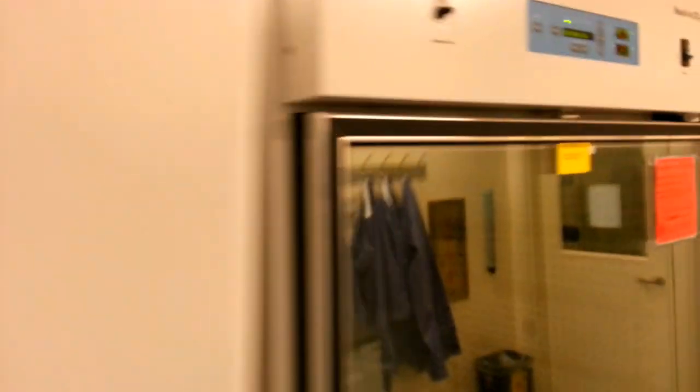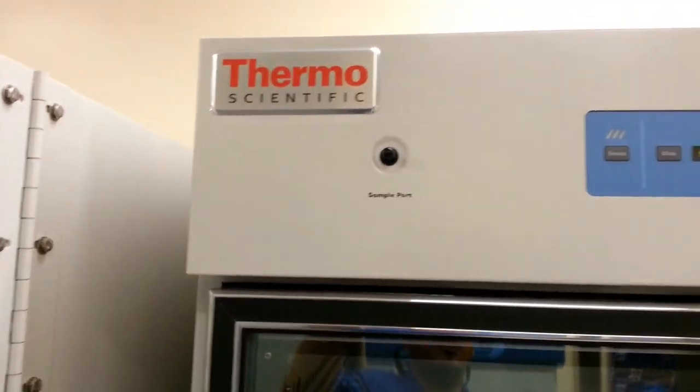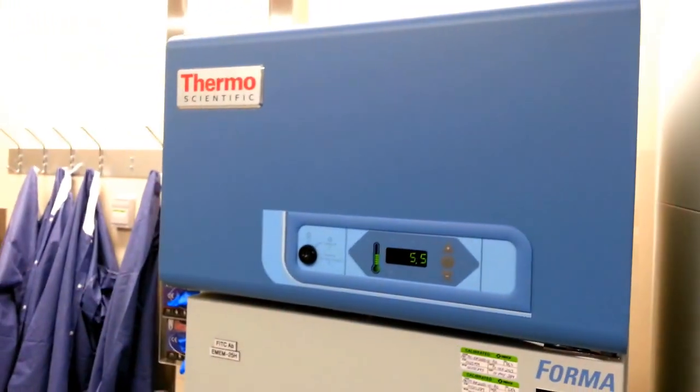We have incubators, CO2 incubators, and we're hoping to become a vendor for these products. As you can see, they make reach-in refrigerators and reach-in freezers.